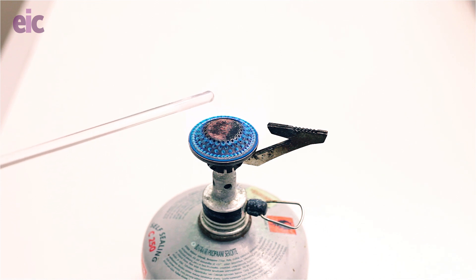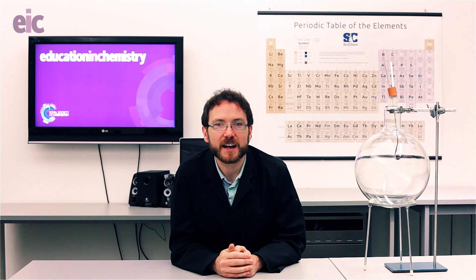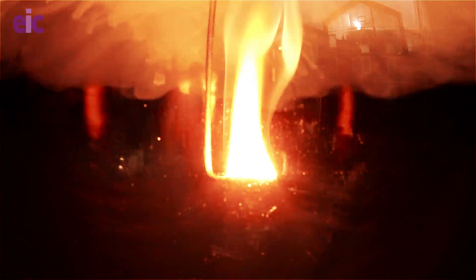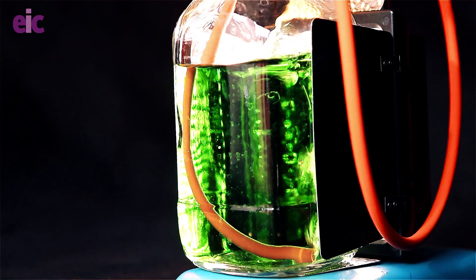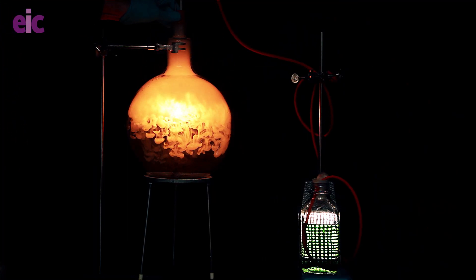Once you're ready, heat the end of a glass stirring rod in a roaring flame for about 30 seconds and touch the end against the phosphorus. This time, very little gas was expelled, so we'll use this solution in a moment.